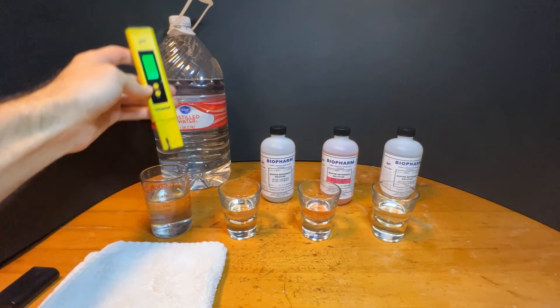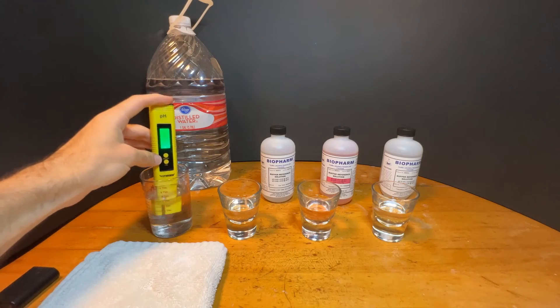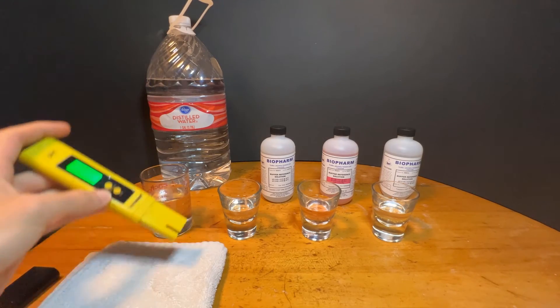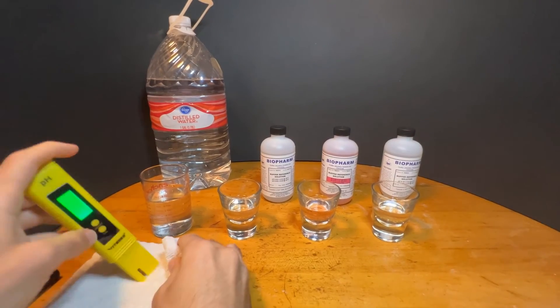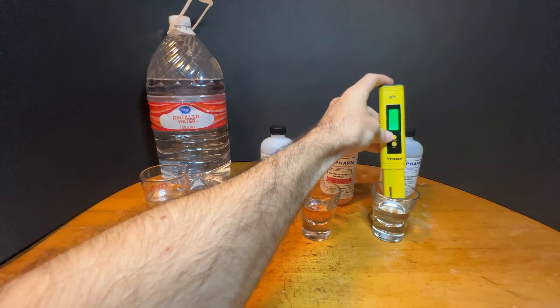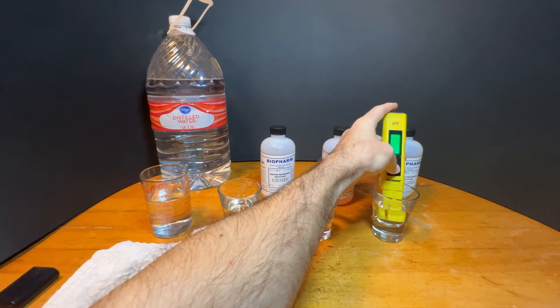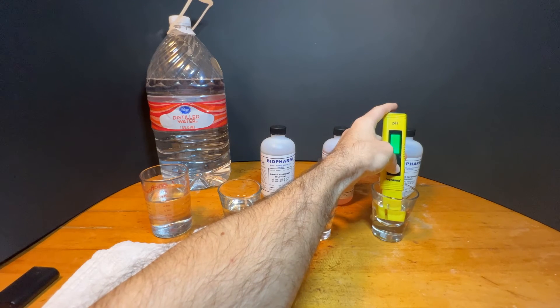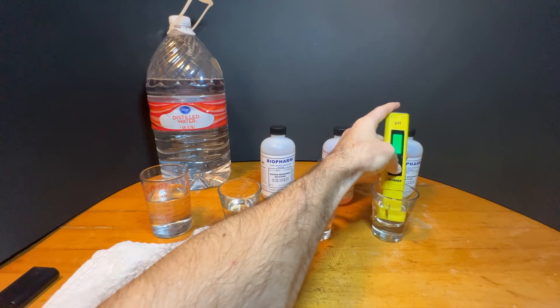Shake it off, rinse it in the distilled water, shake it off, and dry. And one last time, we're going to put it in the final solution. I'm going to press and hold calibrate for five seconds. It flashes three times — we're done.